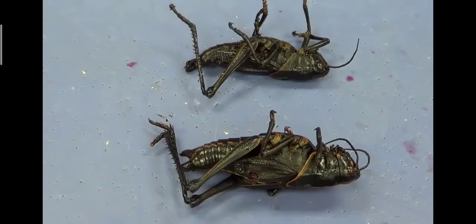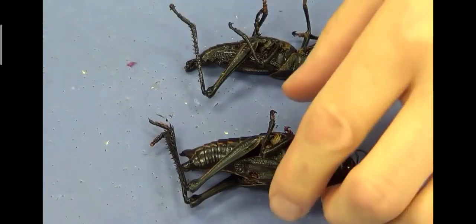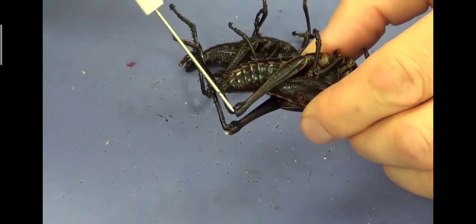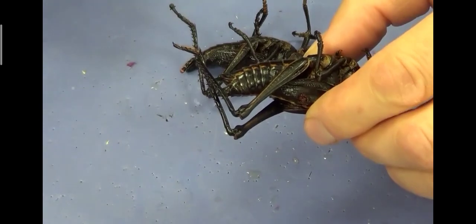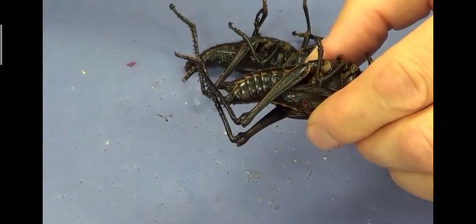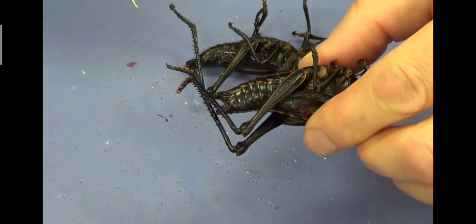So today we'll study the dissection of the grasshopper. Now there are two grasshoppers kept over here which were already set in formalin. Now you can see this grasshopper has a leg. Now there are 6 legs over here.